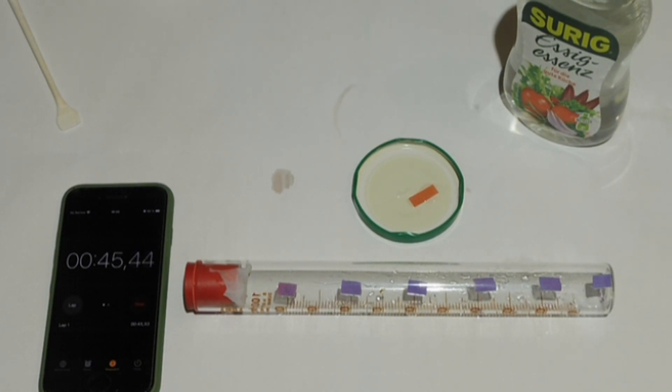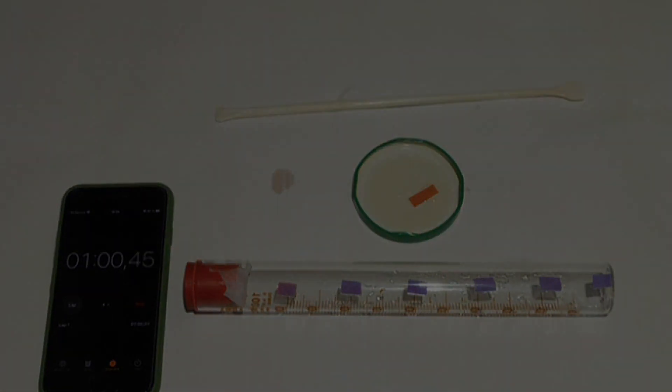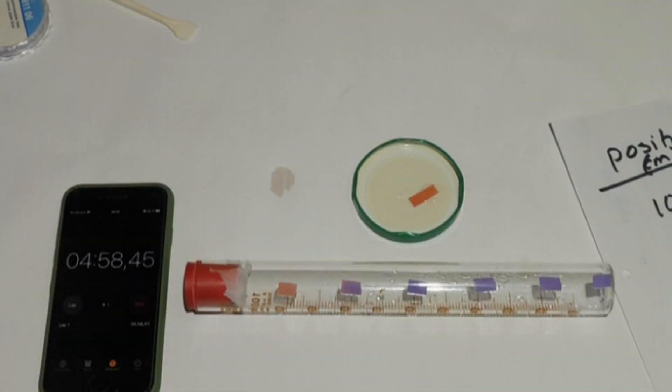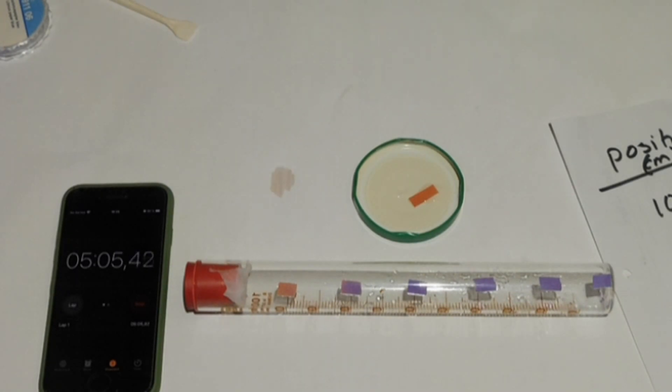I will now leave the experiment to run until all litmus papers have changed color. I will record the time when each litmus paper completely changes to red. After five minutes, the first litmus paper's color is now completely red. The time is then recorded in a suitable data table.